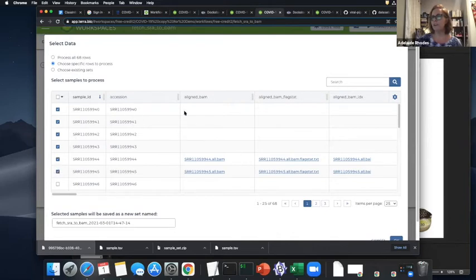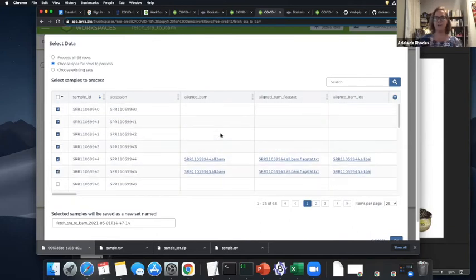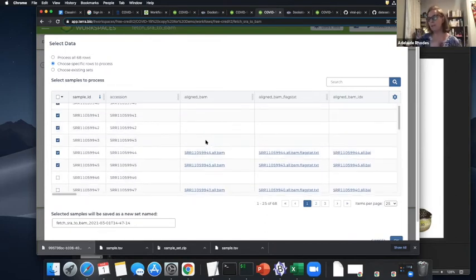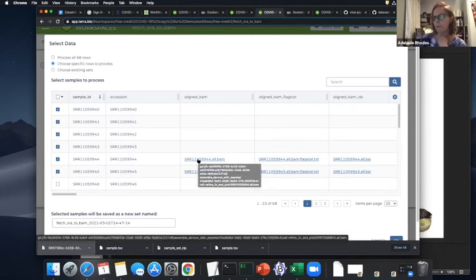So you can see here that some things don't have outputs. This .aligned_BAM is one of the outputs that was in the JSON. Some of them didn't successfully assemble, right? So there are blanks. This is a combined input output table. One of my tests was that I took out all the outputs and only had my inputs, the first 2 columns, and I started running it. I just didn't have time to finish it before here because I wanted the notebook to work. So I had to put this data back in. But these are all outputs that were done here.